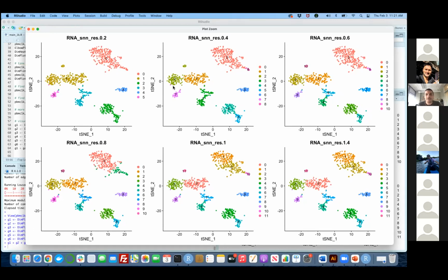Since we are trying to find different patterns of cells having different markers, it is okay to have 1 or 2 cells that potentially could be misclassified. So in this case, you don't really have to worry about that. The only thing we have to understand is that the majority of the cells labeled as such are looking much closer to each other, because we're trying to understand patterns here.